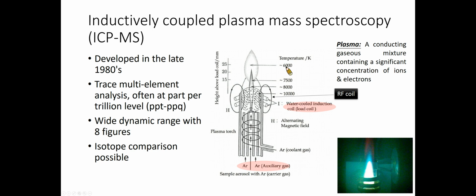The hot temperature means that new argon flowing into the plasma is ionized, which maintains the plasma. The plasma is kept from melting the walls of the quartz tube by an additional tangential flow of argon along the walls of the tube. Finally, the sample is nebulized and sprayed as an aerosol mist into the center of the plasma.